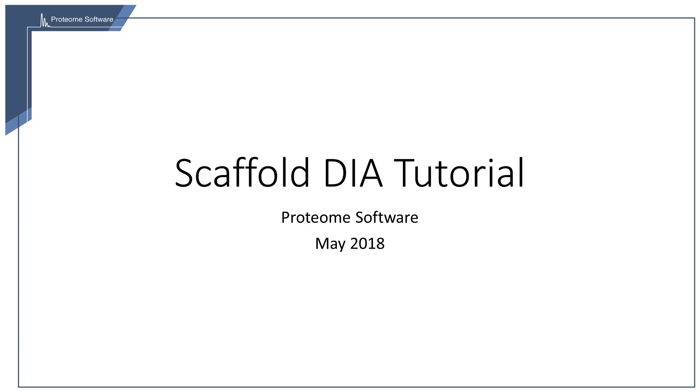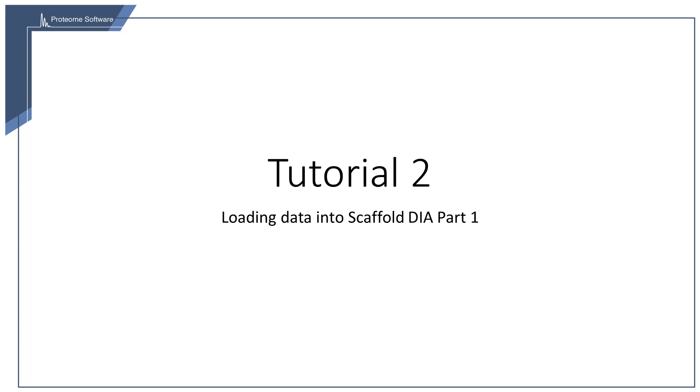Welcome to episode 2 of our Scaffold DIA video tutorial. This is part 1 of a two-part episode on loading data into Scaffold DIA.